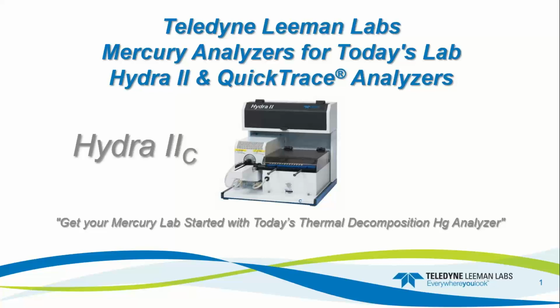Hi, everybody. Thanks for joining today's webinar on the Hydra 2C. Some of the basics of the system will be covered today, the software, how we develop some methods and some tips on some maintenance and so forth.